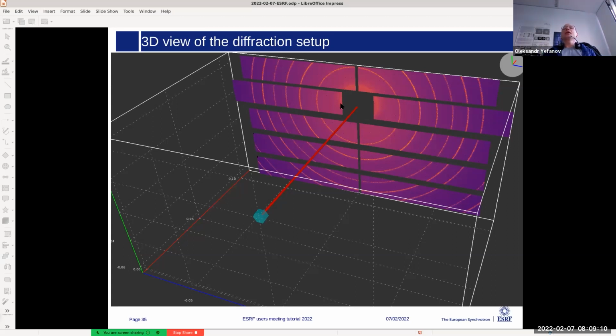Actually, one last question. You mentioned that this geometry file is quite big. So for 16M, it's almost 1 gigabyte. So you have to apply this 1 gigabyte file to every pattern. Isn't it slowing down your calculations? No, because this is reduced in the sparse matrix format later on.